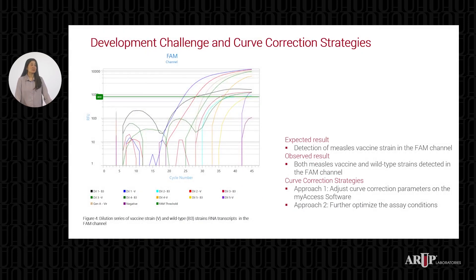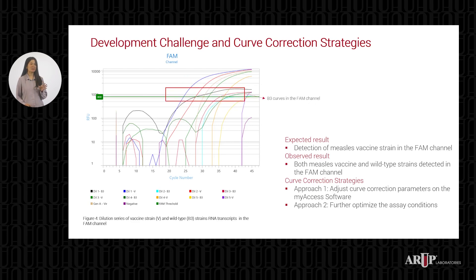This plot shows a dilution series of vaccine and wild-type strain RNA transcripts in the FAM channel. We should only be seeing vaccine strain signal in the FAM channel; however, we also see these flatter-looking curves around the baseline — these are B3 curves. This cross-reactivity is likely due to the MEVA probe having a single nucleotide mismatch with the wild-type strain, leading to some degree of non-specific binding. To resolve this issue, we identified two main approaches: first, adjusting curve correction parameters on myAccess software, and second, further optimizing the assay conditions.